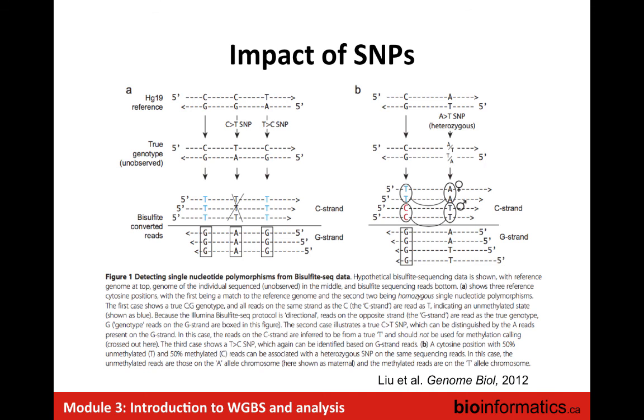Where it gets really exciting, confusing, interesting, slightly almost impossible, is when you take into account the impact of SNPs. This is not what we're going to be doing in the lab per se, but I think it's important to keep that in mind. It's also one of the interesting applications of the sequencing-based assay versus the arrays, that you can pull this information out.